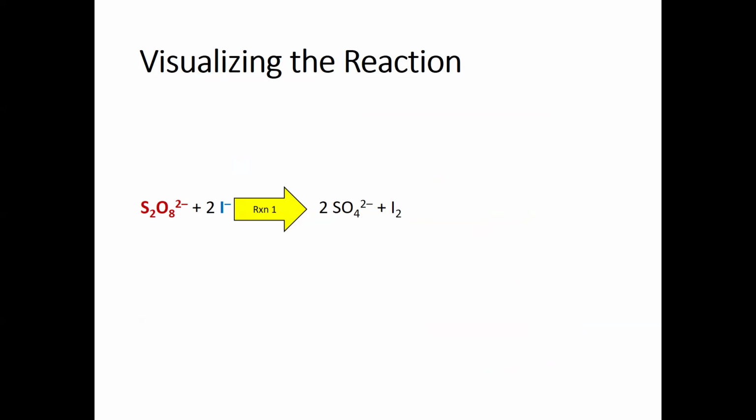So you see before you reaction number one, the one that we desire to monitor. Now, the issue is if you pour the reactants together in a beaker, you're not really going to see a lot happening. And we need to have some way to obviously tell that the reaction is going. And so, fortunately, there is something else we can add to the reaction to have a visual indication that it is making product. And that thing that we're going to add is starch.